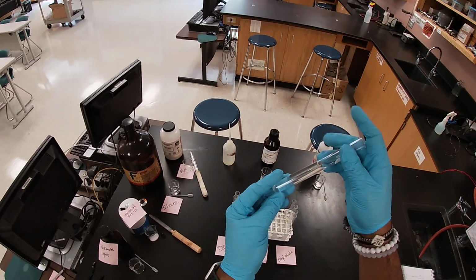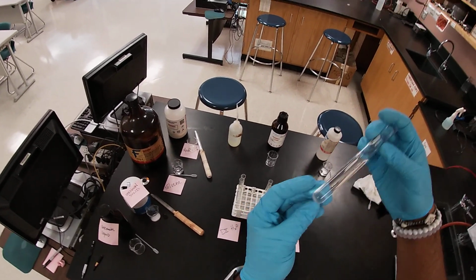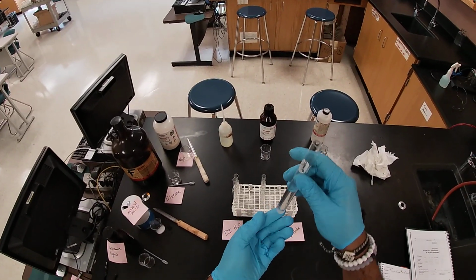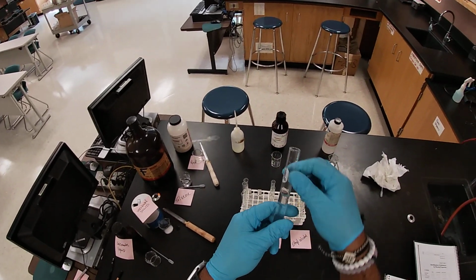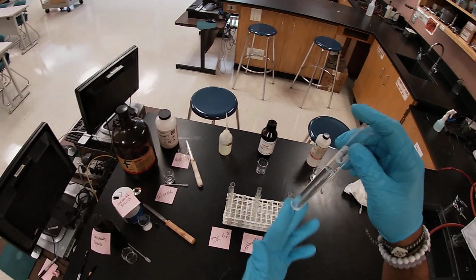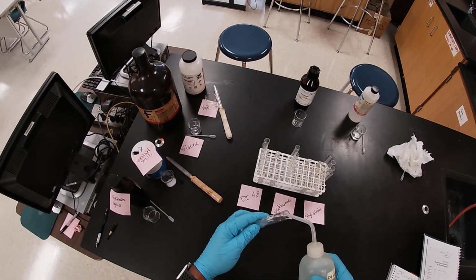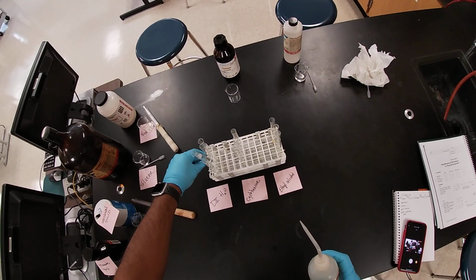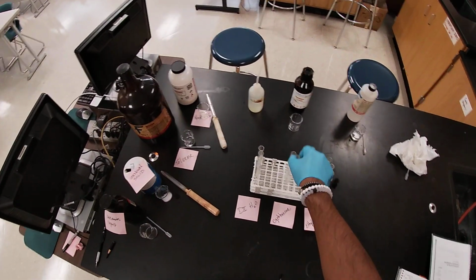And so here we get salt and the amount of salt. And again, we have some salt at the bottom, a little bit of salt, but it's still dissolved in it. Like I said, we probably have a supersaturated solution in here where you have the leftover solid at the bottom, but it seemed to dissolve because I did add quite a bit of that solid in there. And let's add a little bit more water and maybe it will dissolve it. And so the unknown solid did dissolve in that one.